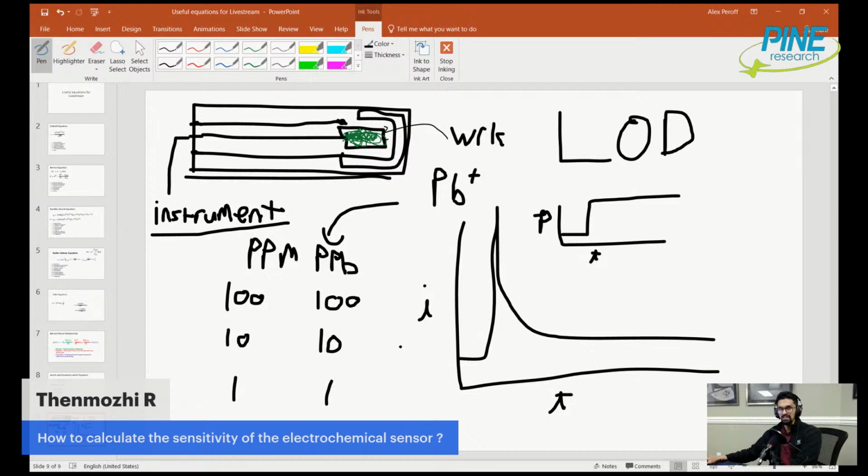I recently made, and by recently I mean last month, a video about chronoamperometry, CA, that describes the technique in more detail. After the electrical double layer is charged, within a relatively short time, maybe within a couple seconds, you can get an analytical measurement based on the Cottrell equation.